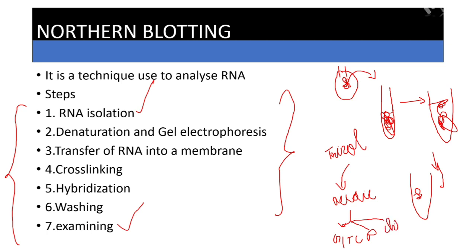We use trizol to separate RNA from DNA. If you want a detailed video on RNA isolation, I'll create a separate video and upload it on YouTube.